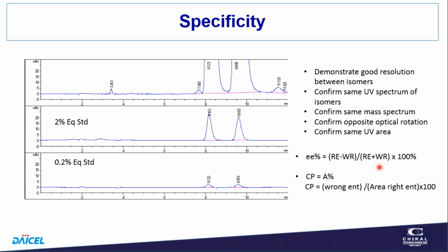And this comes from pre-chiral chromatography days, when the only way to measure the enantiomeric excess or the enantiomeric purity was to do an optical rotation based upon what you would expect the optical rotation to be. The wrong enantiomer gives an opposite response to the desired enantiomer, and it kind of cancels out. So how much rotation you get is just the difference between the two enantiomers. For a racemate, there's no optical rotation.